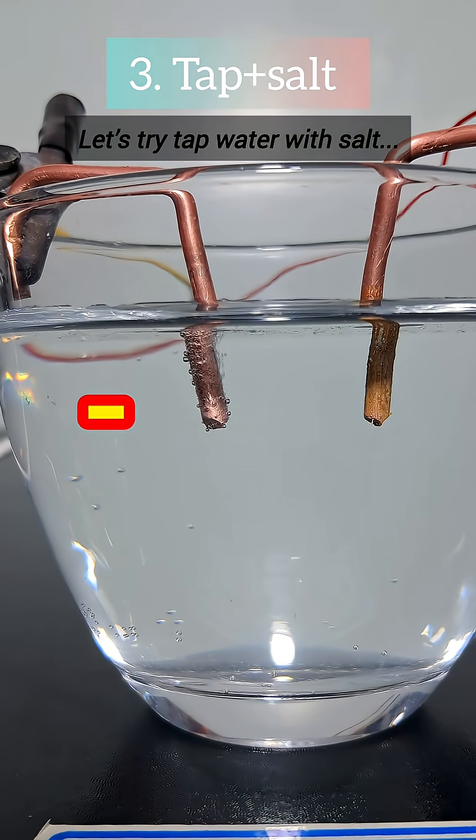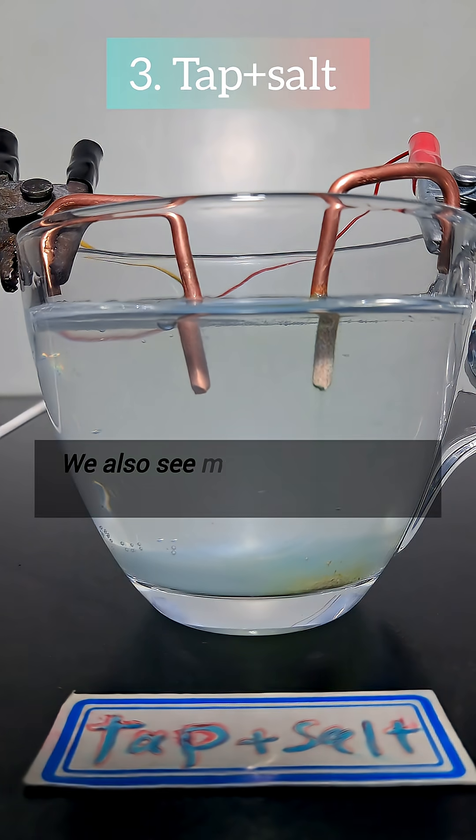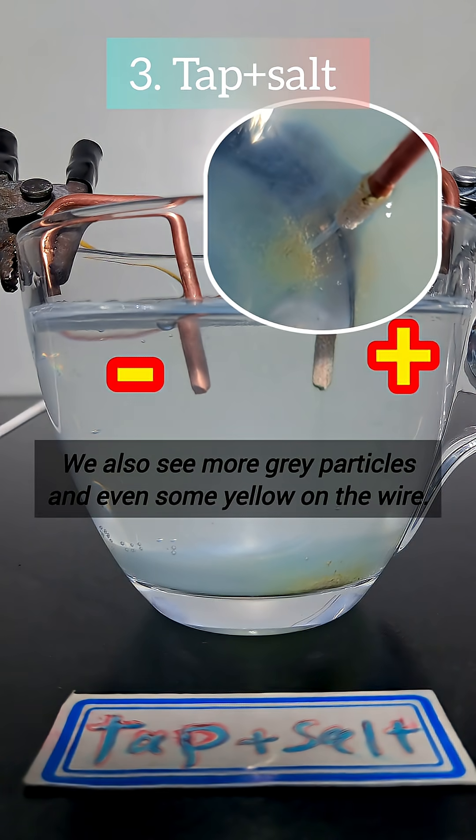Let's try tap water with salt, and this time the bubbling increases a lot. We also see more grey particles, and even some yellow on the wire.